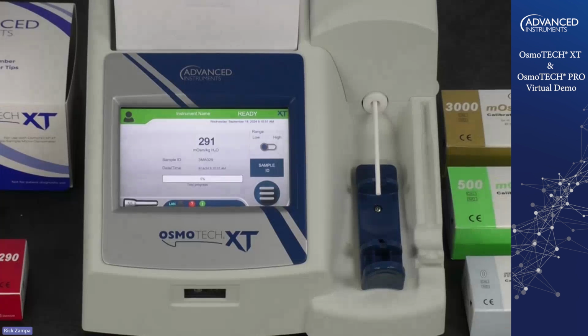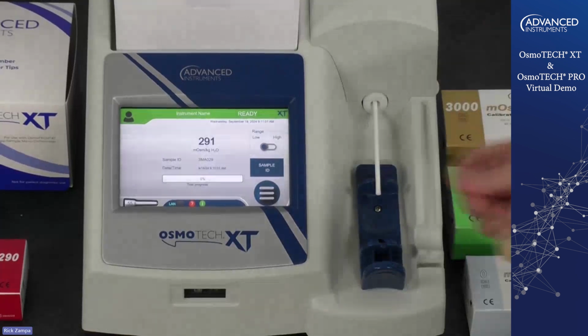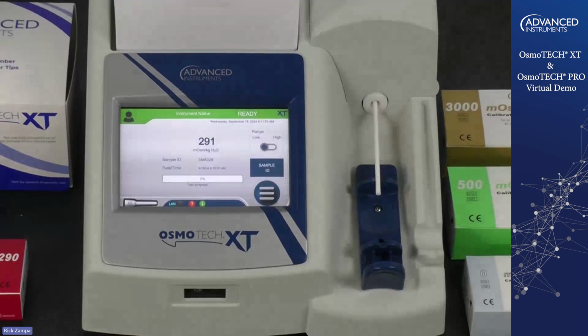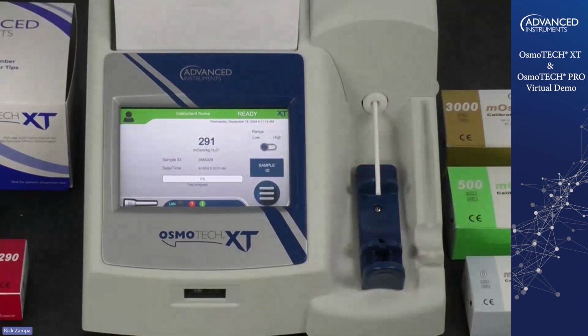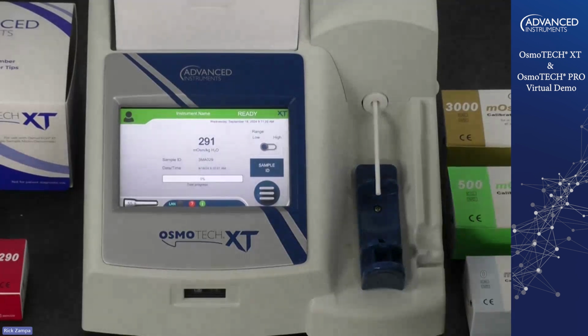The reason we leave it in there is twofold. One, it tells you when you walk up to the instrument that it has been cleaned. And two, it's a physical reminder to you when you come up to the instrument, because you have to take it out, that you need to clean the instrument after every test. This is the one key maintenance point for the instrument. As long as you do this quickly after every test, like I just did here, the test ended in less than a minute. I came over, I cleaned it, took care of it. You should never have any issues with the instrument.